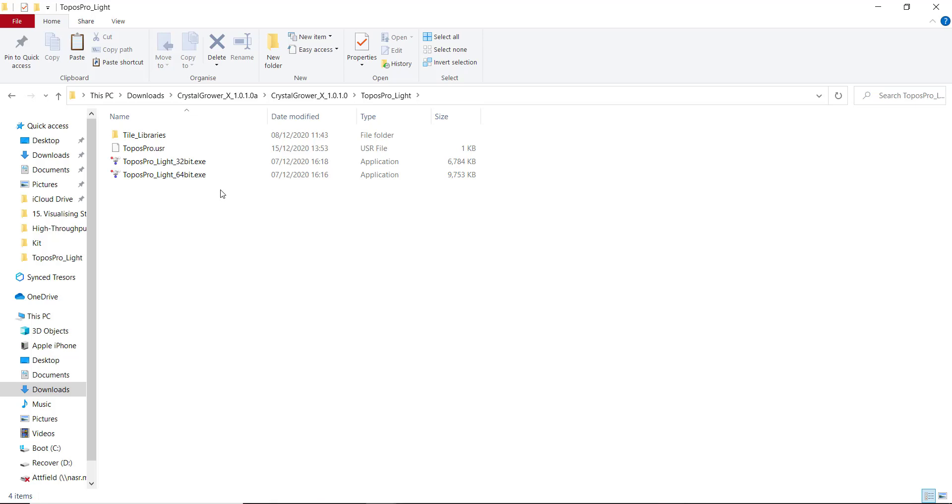This will depend on what operating system you're using. It's also worth noting that ToposPro only works on Windows machines. If you've dual booted your machine with two operating systems, say for example Ubuntu and Windows, or you've used Bootcamp to have Mac and Windows, then it will work on your Windows partition.